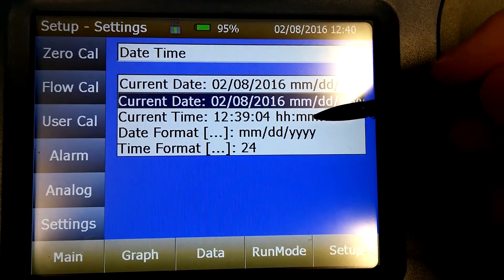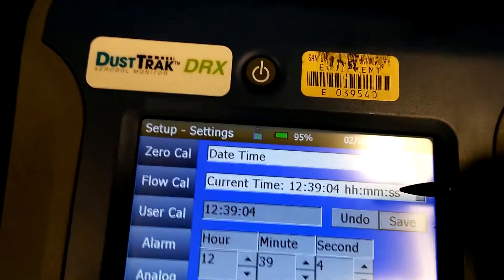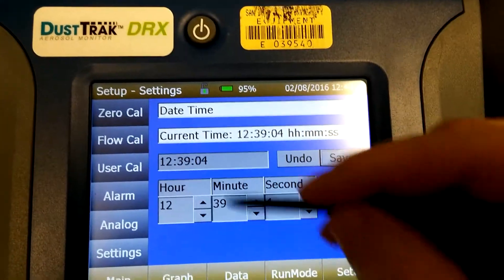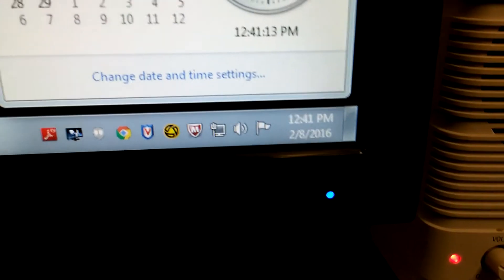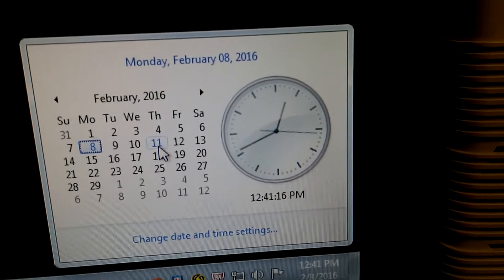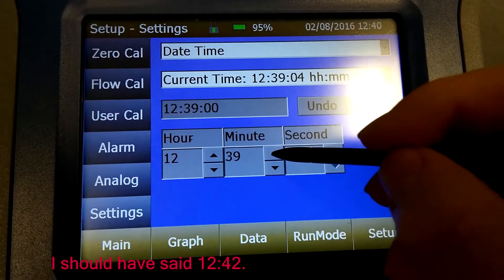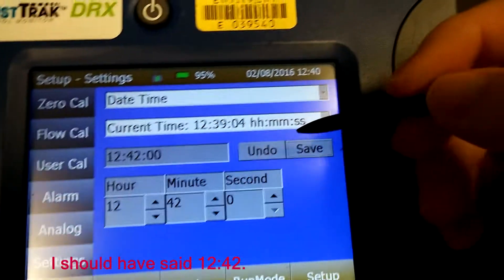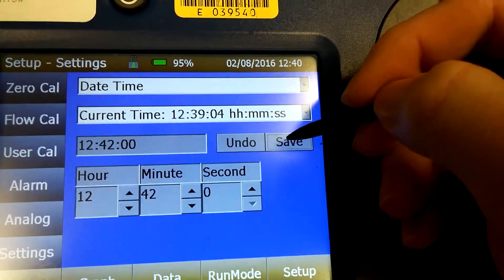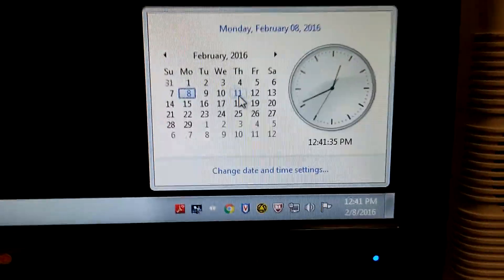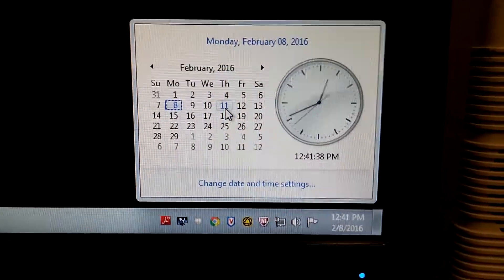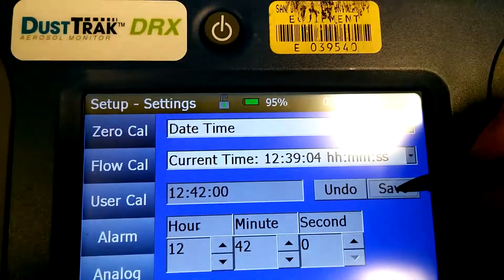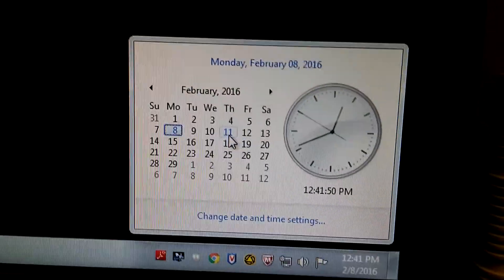Now for the current time — this is where the precision comes in. This is military time, just so you know. The upcoming minute is going to be 12:41, so on here I want 0 seconds and minute 41. Now I'm going to have my stylus hovering over the Save button — I haven't pressed down yet — and when this hits the next minute, 12:42, I'm going to press the Save button.